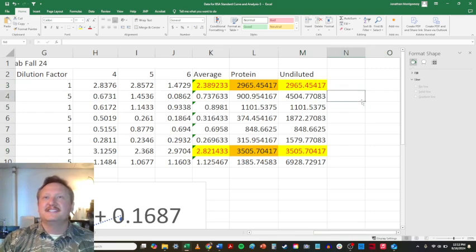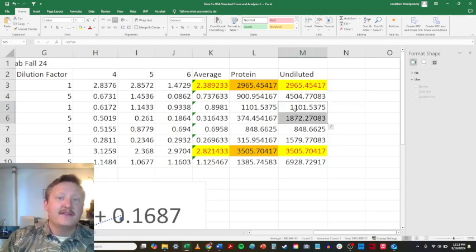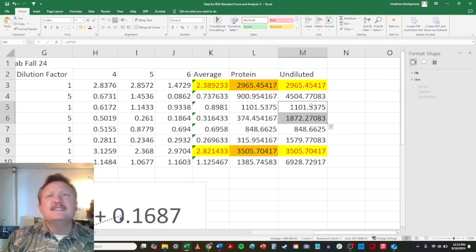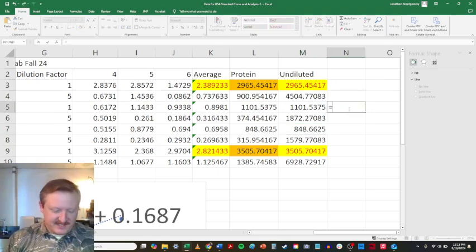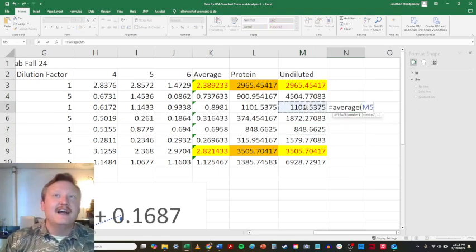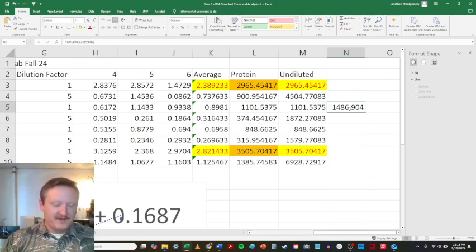So you're going to have some questions here about which were the most effective at lysing cells and freeing up proteins. Alrighty. Now, I don't want to do the final steps here for you, but keep in mind that you can take the average of some of these values. Okay? And you can rearrange this data as you'd like. Alrighty. So, for example, you could take the average of these two values, and that's a fair representation of what's in buffer 2. And the same is true of these two values right here.